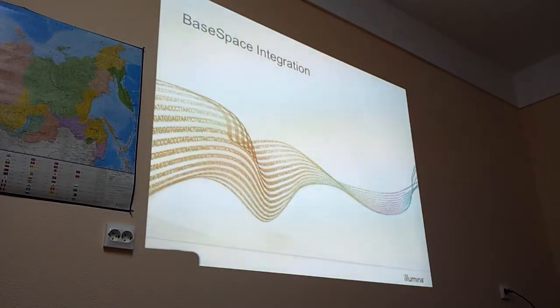But really start to use it, because if you learn to work with the cloud, it is exactly the same principle for BaseSpace on-site. The structure is the same. And BaseSpace is really important for the NextSeq, because we developed it together. So the idea is to use BaseSpace for the NextSeq.